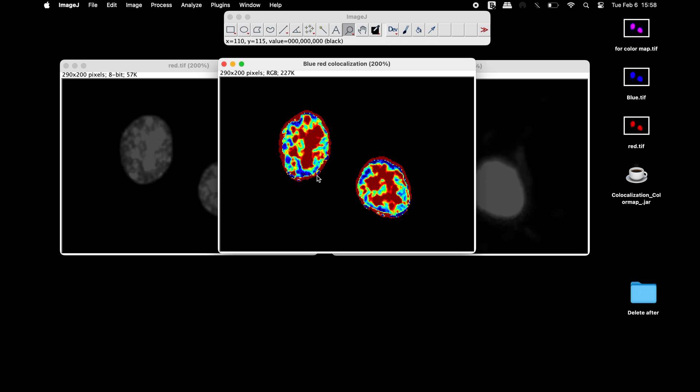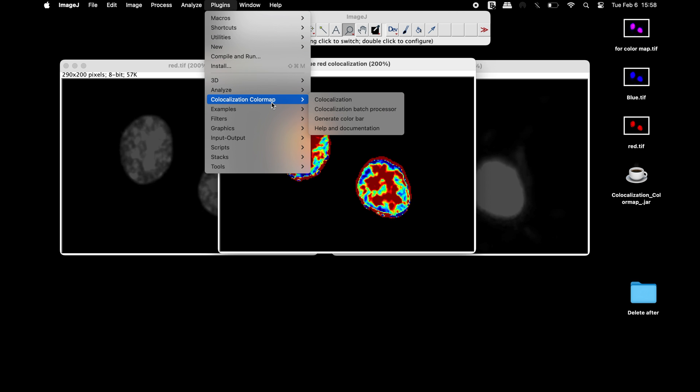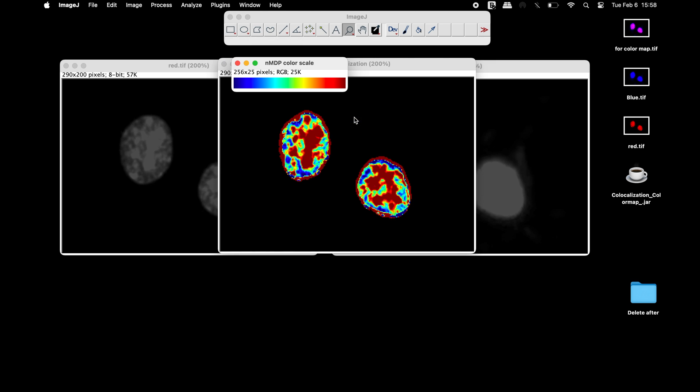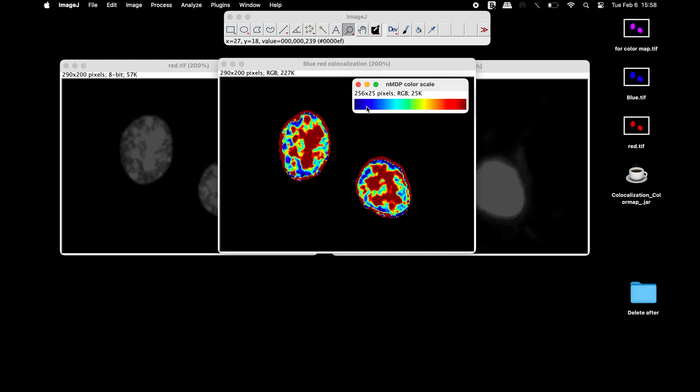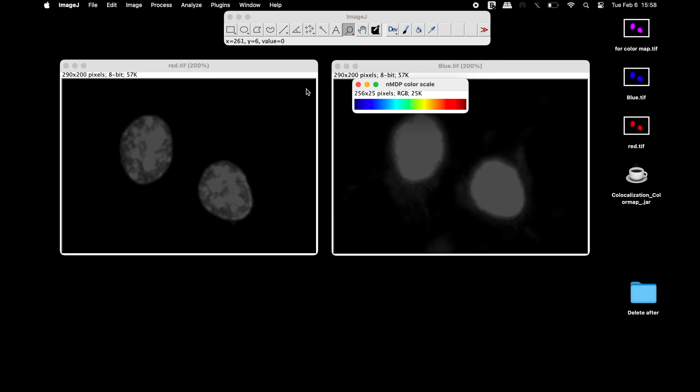The distribution is color coded with cold colors representing negative normalized mean deviation product values. Hot colors are used to express values greater than zero. This enables the generation of a spatial map of co-localization.